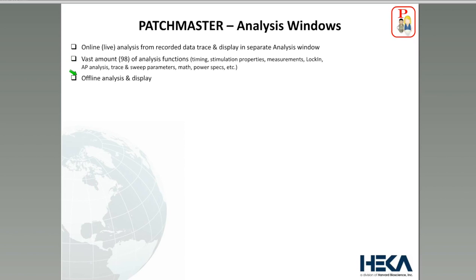And then the third point I would like you to remember here with the analysis window, that it is also possible to analyze data after they have been recorded. And you can use basically the same way than what you would use for the online analysis.